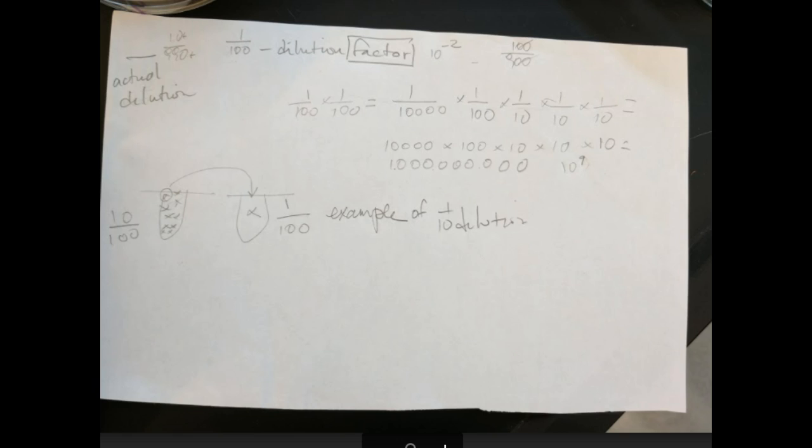Let's take a quick step back and think for a second about what this dilution series is. We already said a series is a sequence, and I said you probably know what a dilution is already. Okay, now let's go over that.